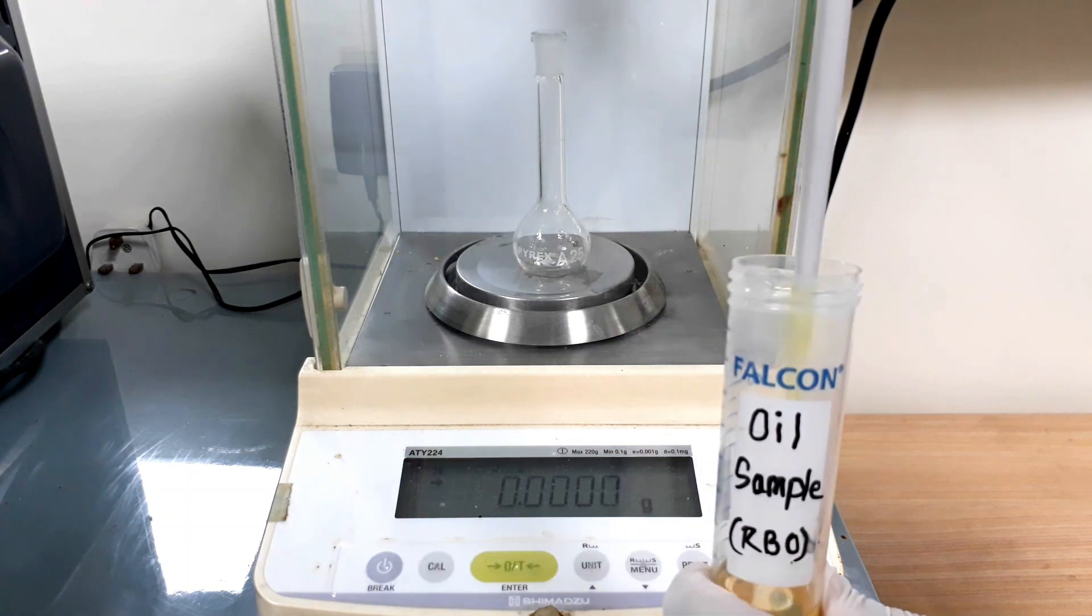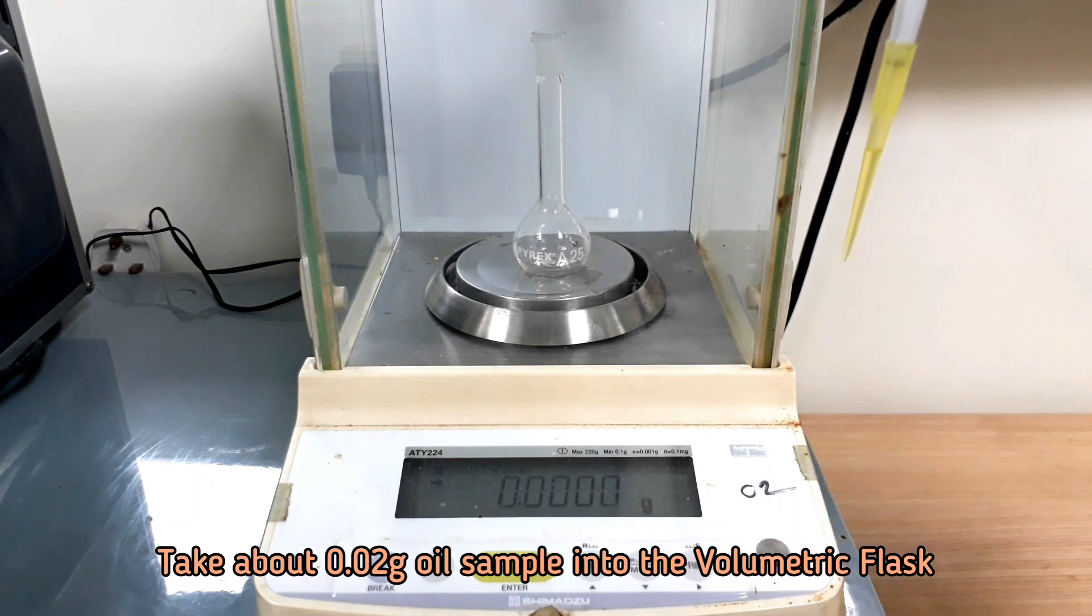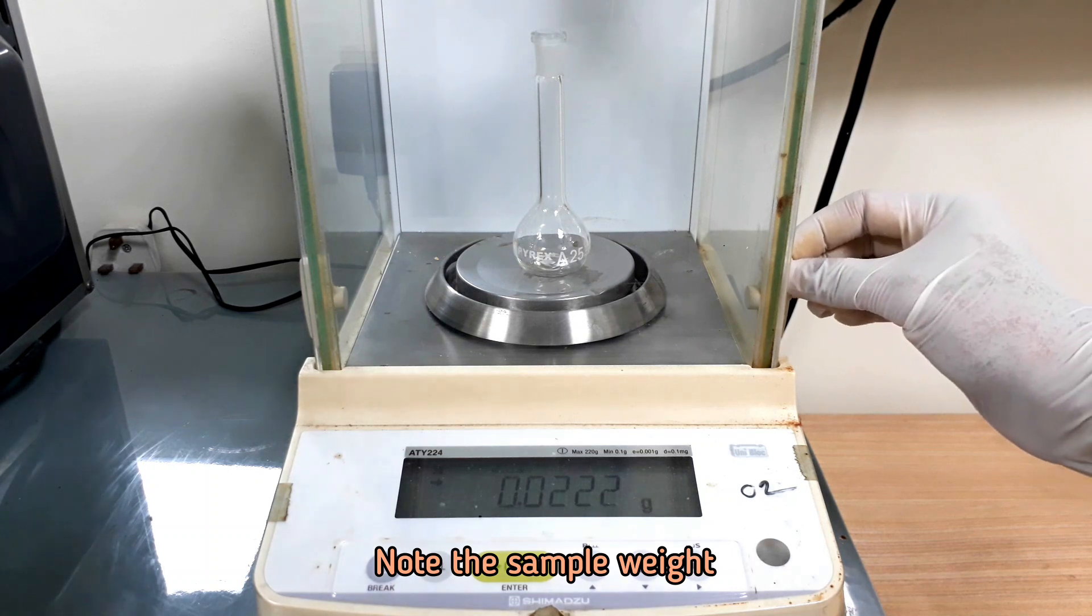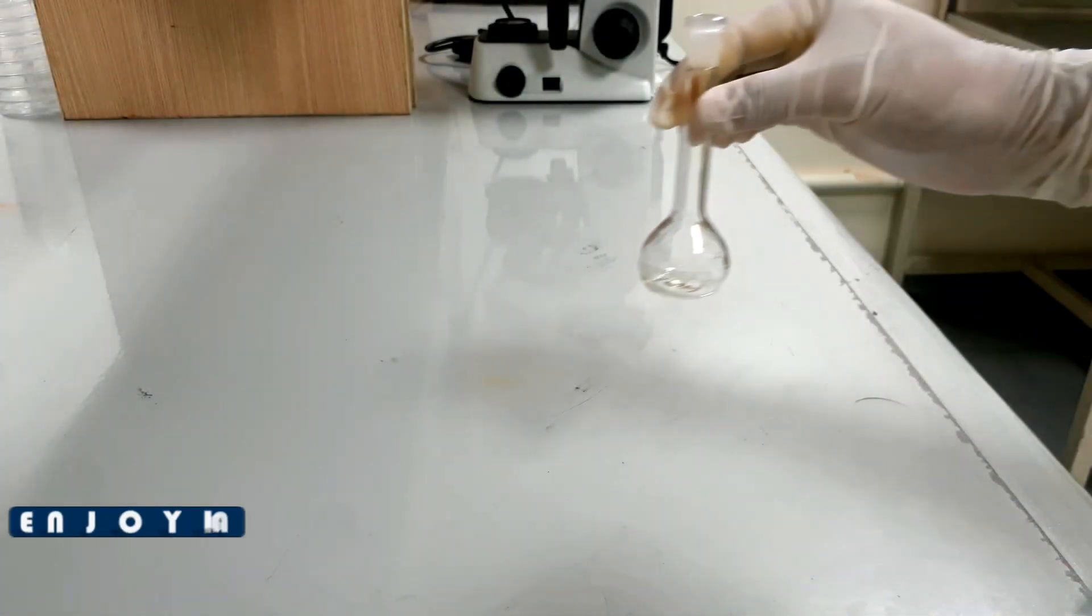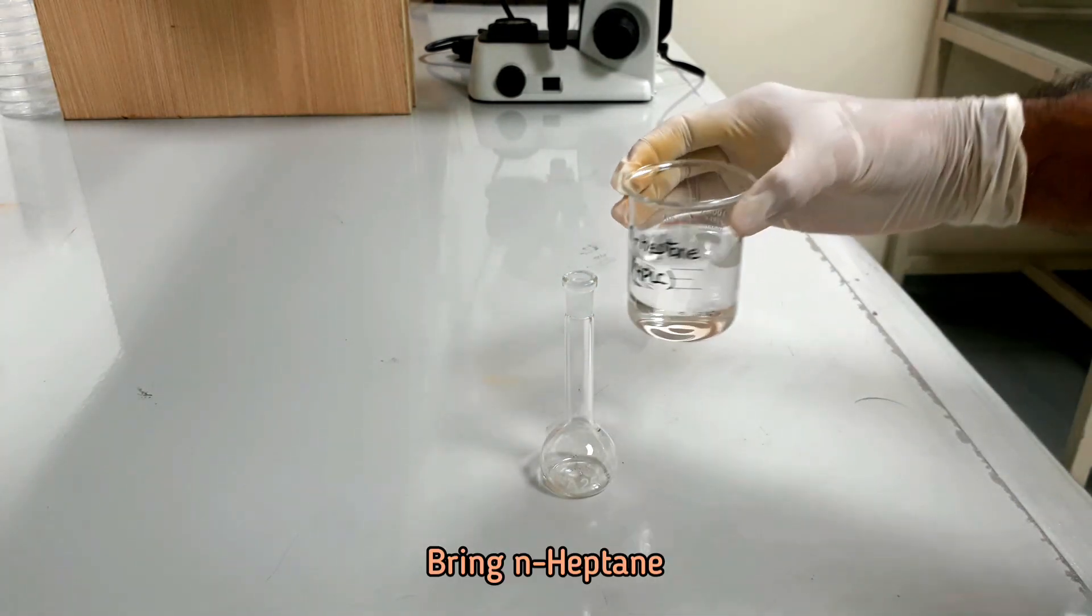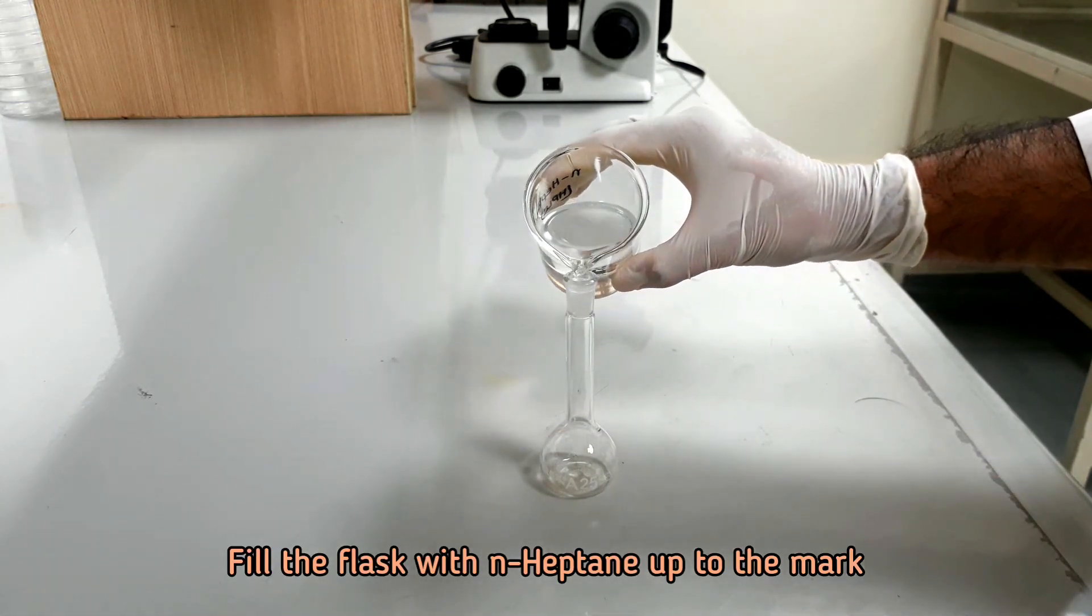Take about 0.02 gram of oil sample into a 25 ml volumetric flask. Note the sample weight. Now fill the flask with n-heptane up to the mark.